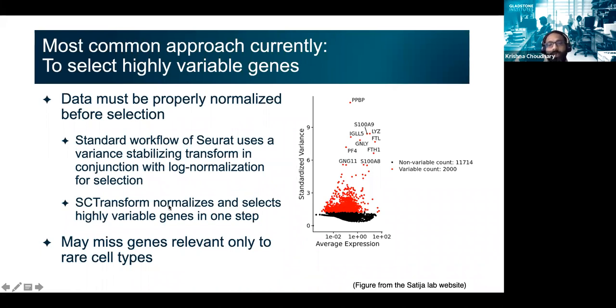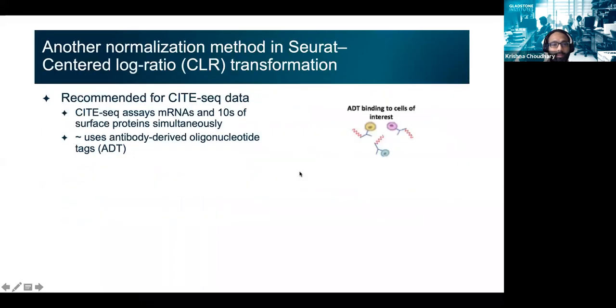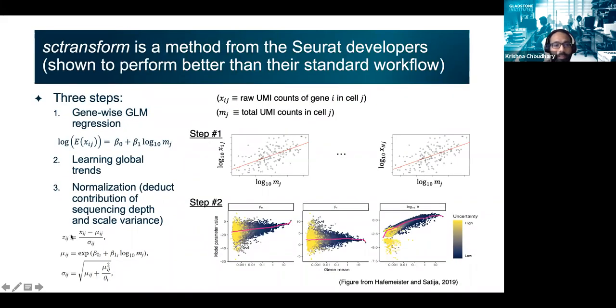If you are running SCTransform, then the normalized Pearson residuals, the normalized expression level from SCTransform, you can take the variance of that, and that is already the standardized variance. That is my understanding. But if you are working with log normalization, then there is a similar in spirit approach to assess standardized variance. Let's just look at this equation here.